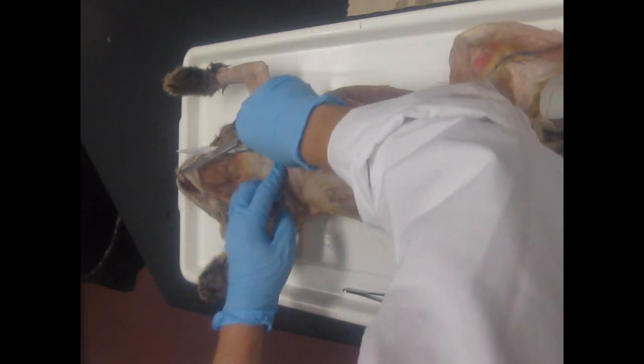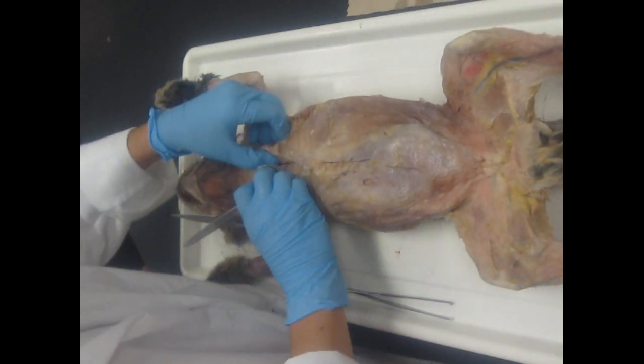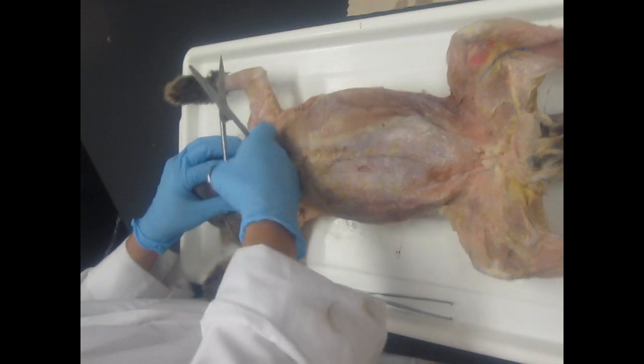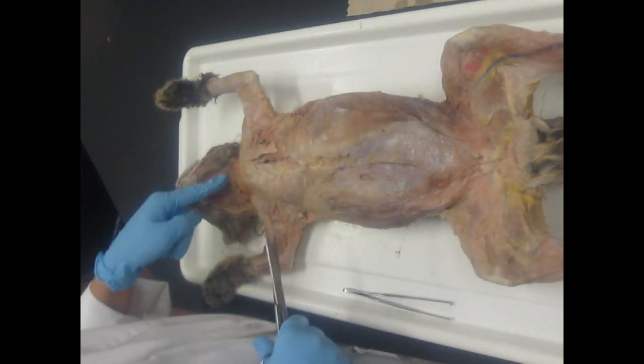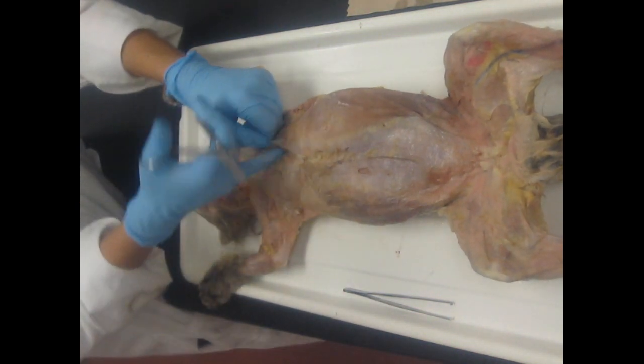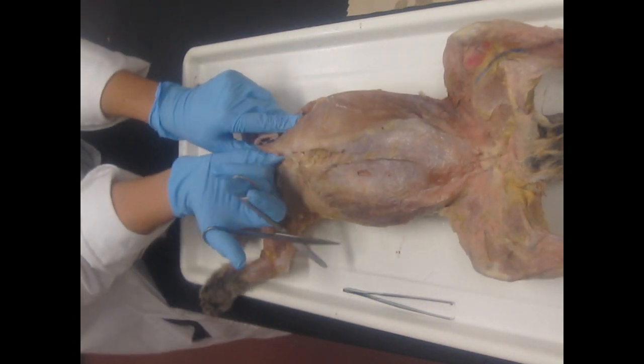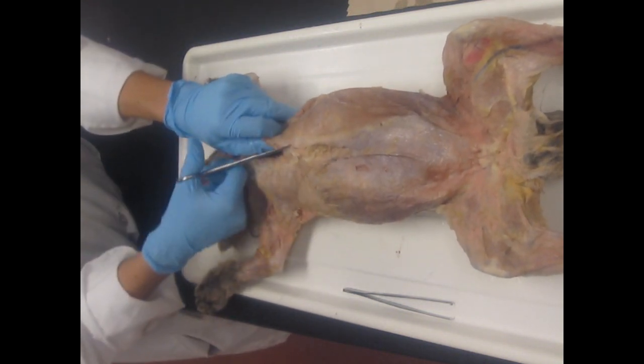As we cut through that costal cartilage, lift up and cut. You're going to do that all the way to the top of the thoracic cavity to where you can't cut anymore. Not all the way up through the neck. Now you're going to turn around and go the other way until you meet the diaphragm. Not go through the diaphragm, just meet it. Okay, so I'm right about there.